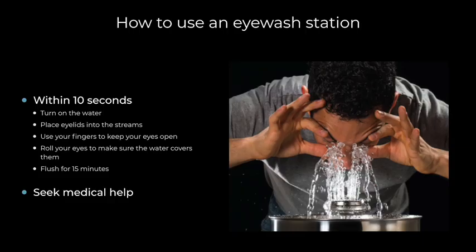Use your fingers to keep your eyes open, and roll your eyes to ensure that the water covers them completely. Flush your eyes for at least 15 minutes. Seek medical attention immediately after flushing your eyes.